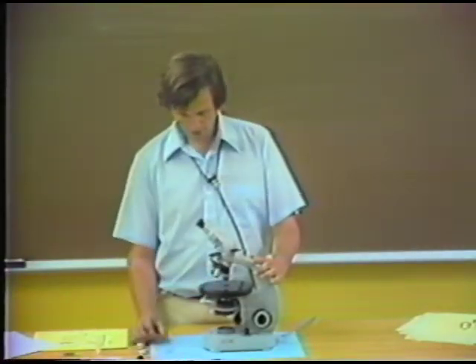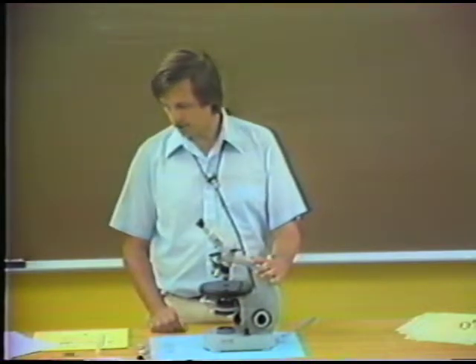So again, this is a redundant kind of test, and what you find is that for some grains, using the oblique illumination test is much better, much easier to see the result than using the central illumination test. So you can use either depending on whether these grains are suitable for one test or the other. Or if there's some question about the result, you can perform both tests to test the relief of particular mineral grains. So this is the oblique illumination test demonstrating positive and negative relief.